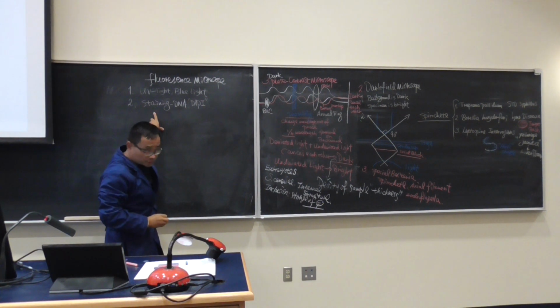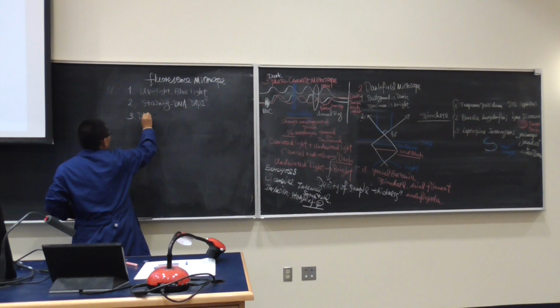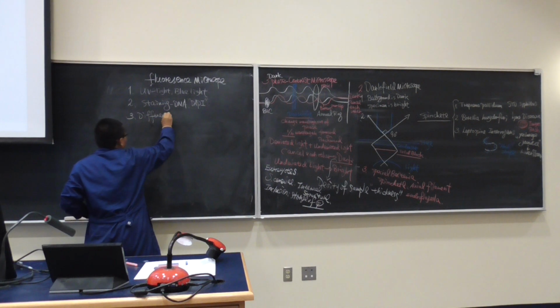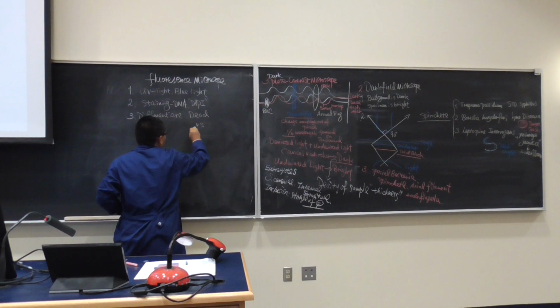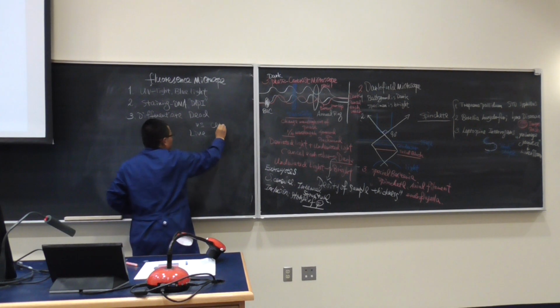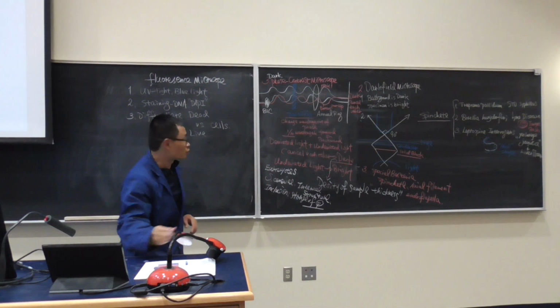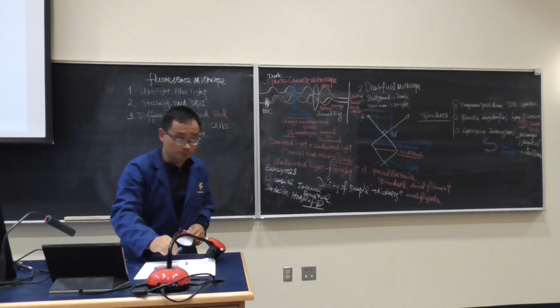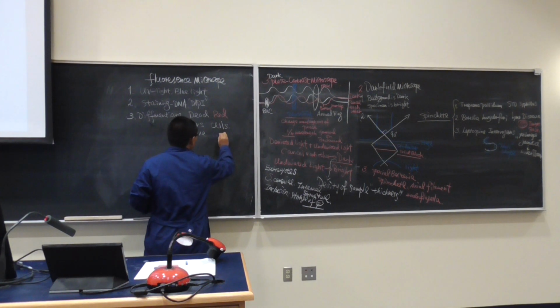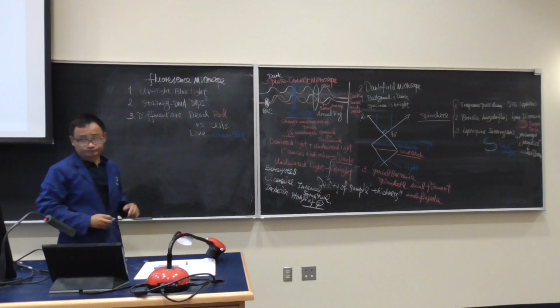Now, why is it important to stain the DNA? Because it could differentiate dead versus live cell. This is a big advantage. The dead cell, usually it is red color. And the live cell, it is blue, sometimes green color. So green to blue color. That's a good thing, because it's staining the DNA.